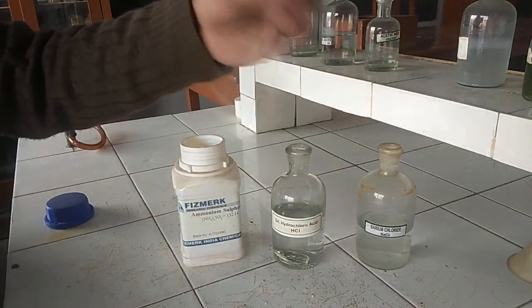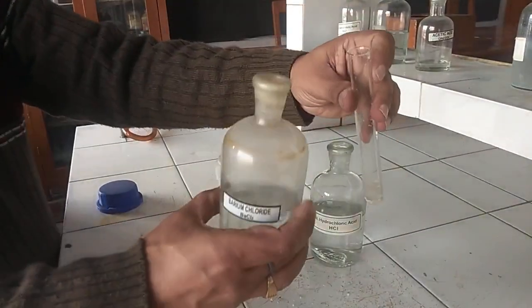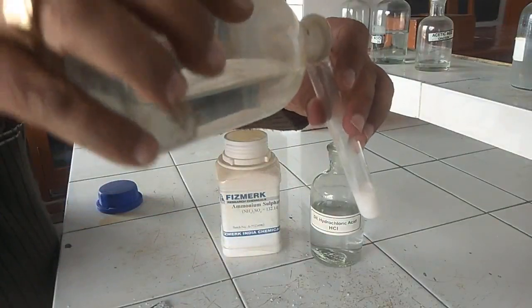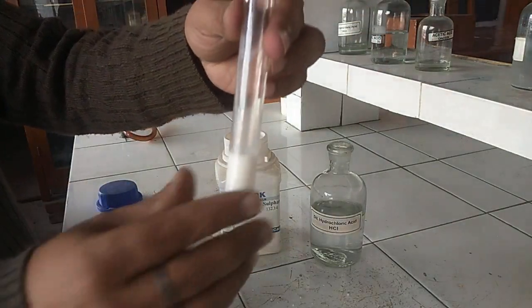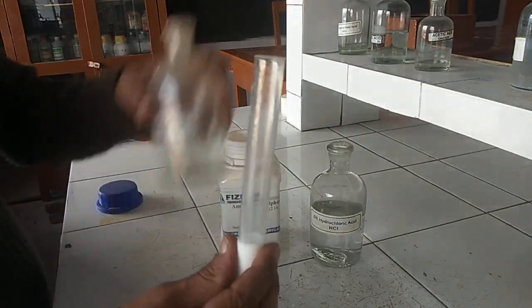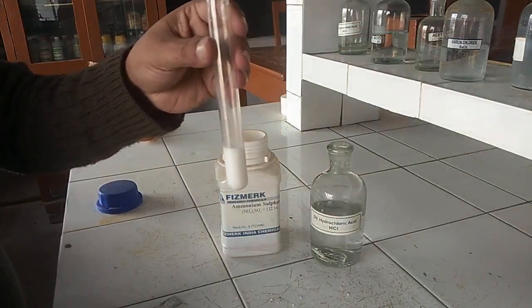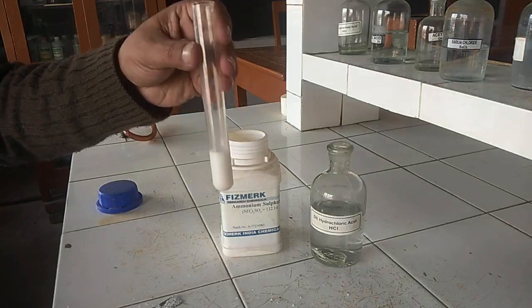Now we will add barium chloride to this. Barium ions from barium chloride react with sulfate ions and give a white precipitate of barium sulfate. This confirms the presence of sulfate ion in the salt.